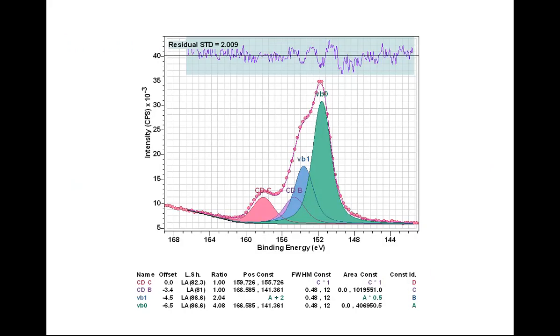If the line shapes were the precise line shapes for these data, then it might be possible to use nonlinear least squares to fit these data and produce the correct ratio for all of these peaks, and the offsets also agreeing with the construction of this spectrum envelope.